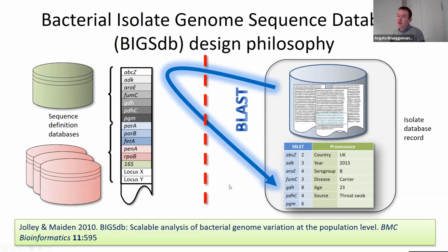And from that, the amount of time it takes to scan a genome against maybe 2,000 loci is about a minute or so. That's on one processor core. And this is running on a server that's got 120 different cores, so we can parallelize this really quickly. This used to be a bottleneck in the whole process, but it's significantly quicker. We can do about 25,000 genomes a day now on the one server. You don't normally have to do that many, but we can. So it's not really a problem anymore.